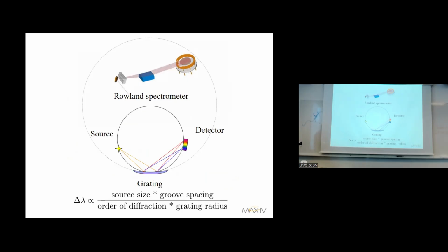So I thought I'd just, before returning to the science, talk a little bit about instrument design. So essentially, a RIXS instrument is very easy. You have a source. In the old time, it was a slit. Now it's the spot itself from the synchrotron. You have a grating. You can rule the grating differently, with different line densities. You have a detector that records the image: photo plates, a CCD detector, or an MCP detector with a delay line anode or something like that. So this is the basics.